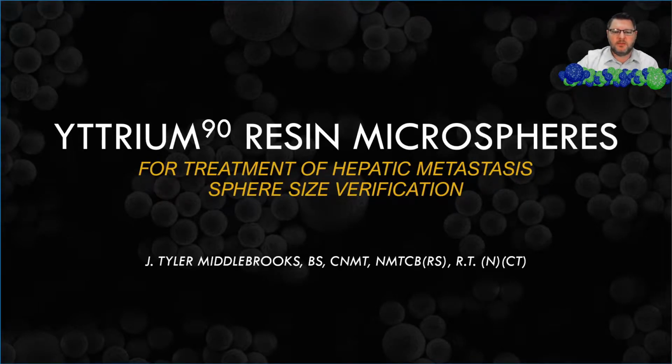Hello everyone, my name is Tyler Middlebrooks, and today we're going to go over Y-90 resin microspheres. These are used for treatment of hepatic metastasis. Today we're going to do a brief presentation on sphere size verification.